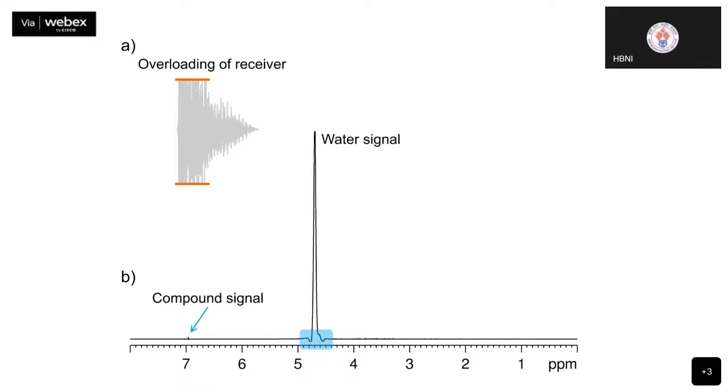This is the gain factor which is complex and which has to be adjusted, optimized. Therefore there are various schemes to suppress the water signal in the spectrum. This has been discussed earlier, WATERGATE and things like that. We discussed it when we were talking about gradients, use of gradients to suppress the water signal. We talked about that, and the reason for that is what we indicated here.